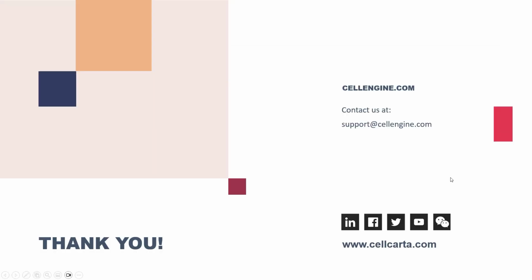This concludes the basic gating features of CellEngine, from setting up compensation and scaling through gate placement and adjustment. Next time, we'll discuss how to position gates independently for different samples in the experiment, go over how to import populations, compensation, or scaling, and create Boolean and combination gates together.